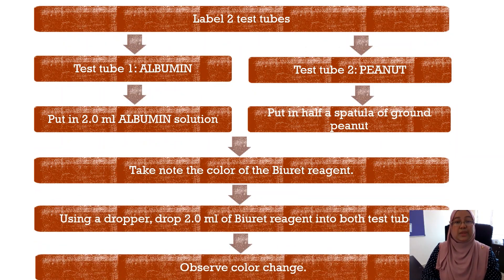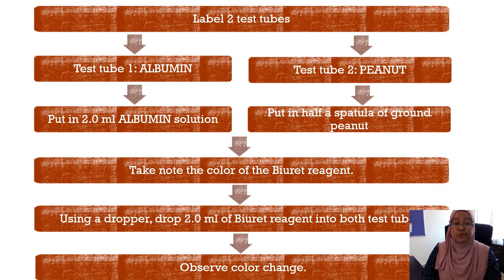This procedure is carried out to determine the presence of protein. Label two test tubes: test tube one for albumin, test tube two for peanut. In test tube one, put in 2 ml of albumin solution; in test tube two, put in half a spatula of ground peanut. Take note of the color of the Biuret reagent, then using a dropper, add 2 ml of Biuret reagent into both test tubes and observe any color changes.